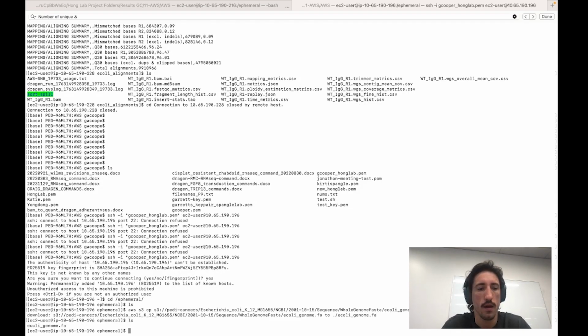Okay. And so then what we're going to need to do is create the hash reference, which is a file format that DRAGEN uses to perform alignment very quickly. And so I'm just going to make a directory called mg1655, and this will be the hash version 11. This is kind of just terminology within DRAGEN. But ultimately, you can save this for the future. If you just want to pull this hash graph directly onto your DRAGEN instance, you won't have to redo this whole process.